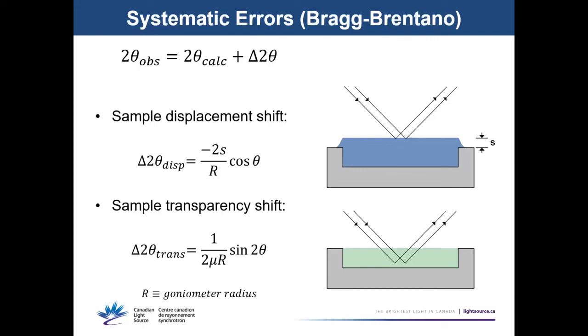Displacement can also occur in Debye-Scherrer geometry, and GSAS-II has a correction for capillary displacement programmed into it. You can account for displacement pretty well with Rietveld refinement, but if it's really pronounced, the peak shift can make it difficult to properly do search-match phase identification. You might have difficulty properly identifying the crystalline phases in your material if you've got enough displacement.